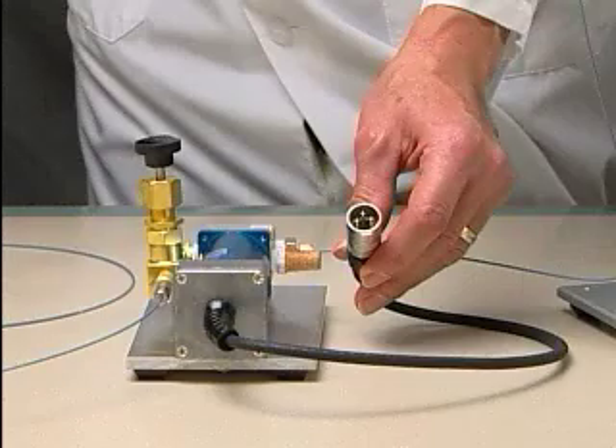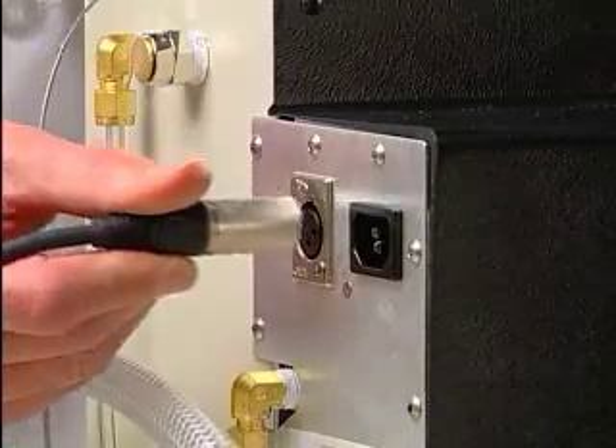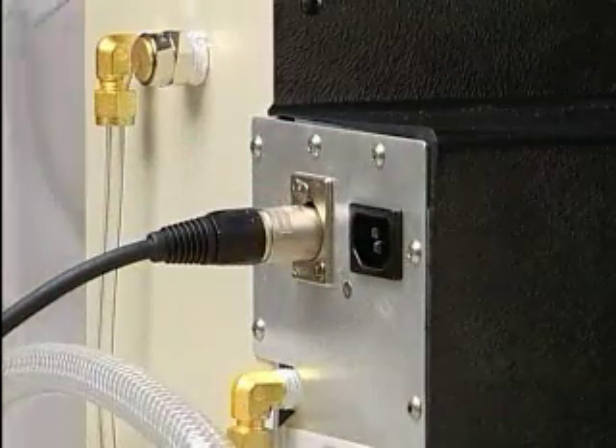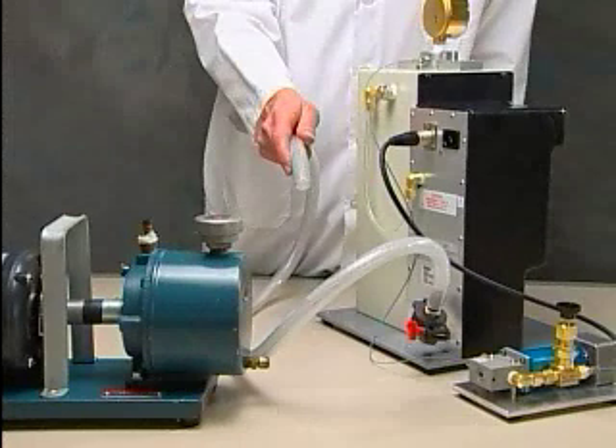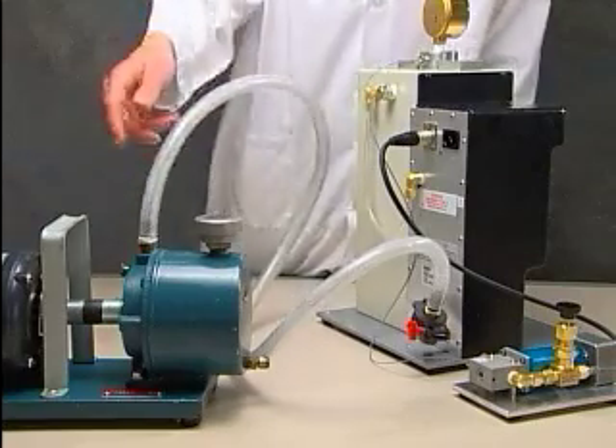Plug the power cord of the three-way helium valve into the rear of the PDS unit. The vacuum hose assembly is already connected to the port on the rear of the unit via the clamping assembly. The free end of the vacuum hose assembly must be connected to the vacuum source.